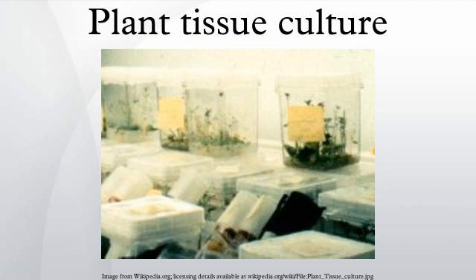Explants are then usually placed on the surface of a solid culture medium, but are sometimes placed directly into a liquid medium, particularly when cell suspension cultures are desired. Solid and liquid media are generally composed of inorganic salts plus a few organic nutrients, vitamins and plant hormones. Solid media are prepared from liquid media with the addition of a gelling agent, usually purified agar. The composition of the medium, particularly the plant hormones and the nitrogen source, have profound effects on the morphology of the tissues that grow from the initial explant.